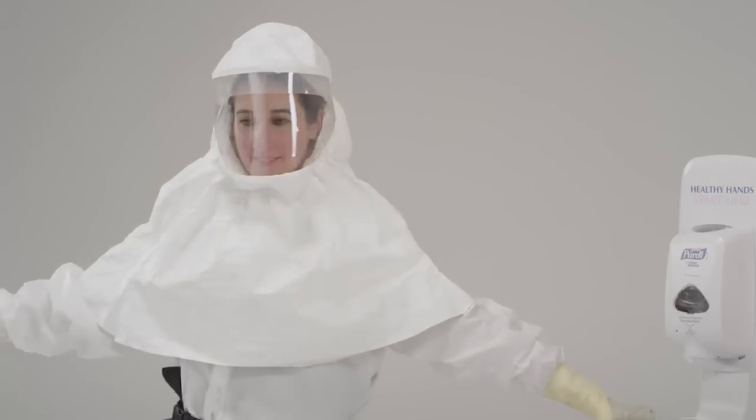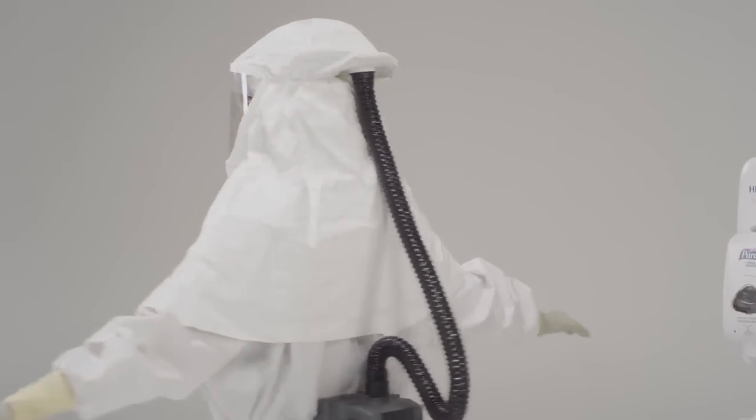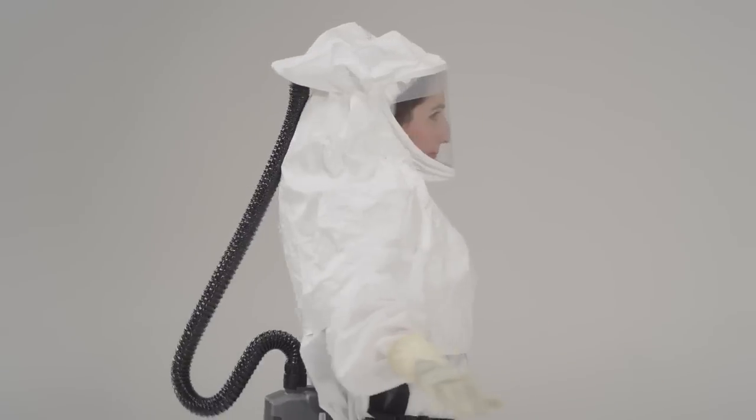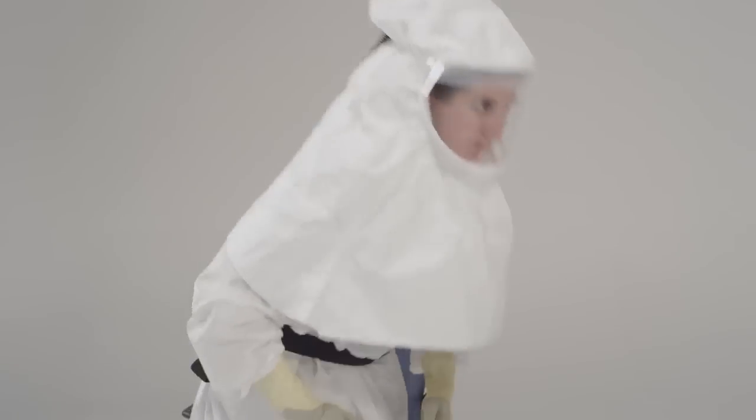The health care provider should have an unobstructed field of vision through the hood. A mirror in the room can be a useful tool for the health care provider while donning personal protective equipment.